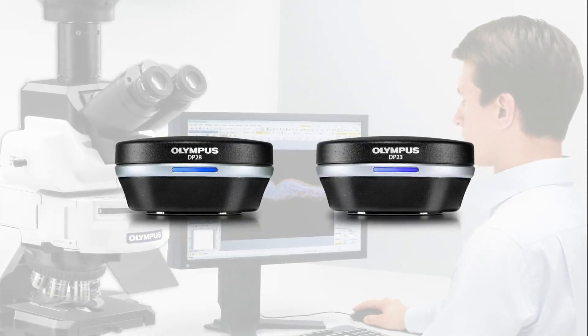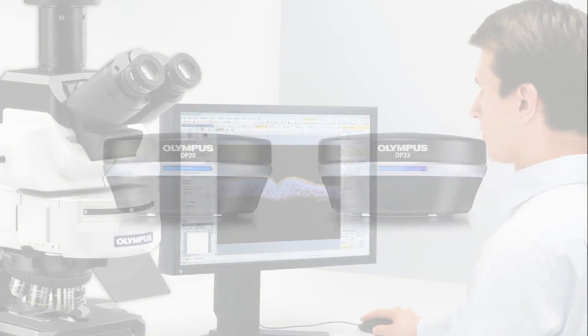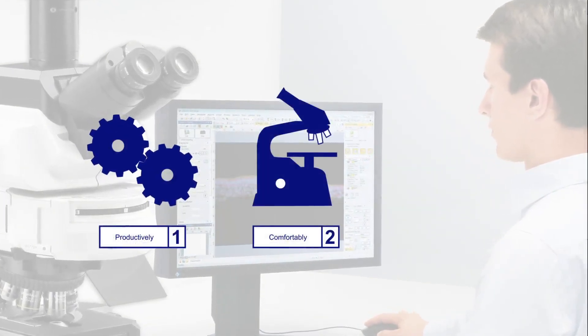The DP28 and DP23 cameras capture the full potential of your microscope, so you can work more productively, comfortably, and collaboratively.